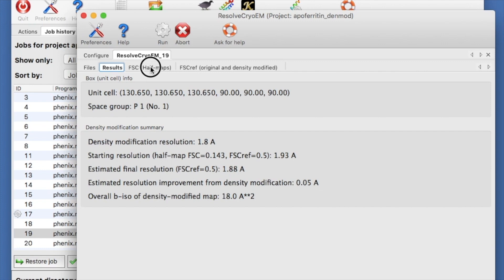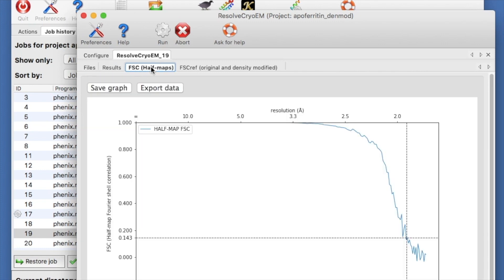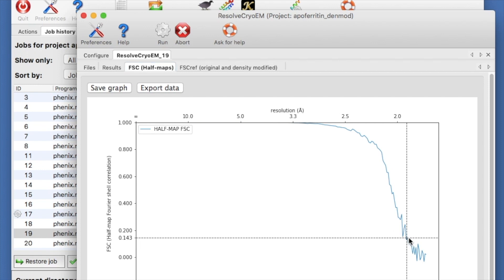The next tab shows the Fourier shell correlation of the starting half maps. Notice that the correlation is very high until the resolution gets close to 1.9 angstroms.